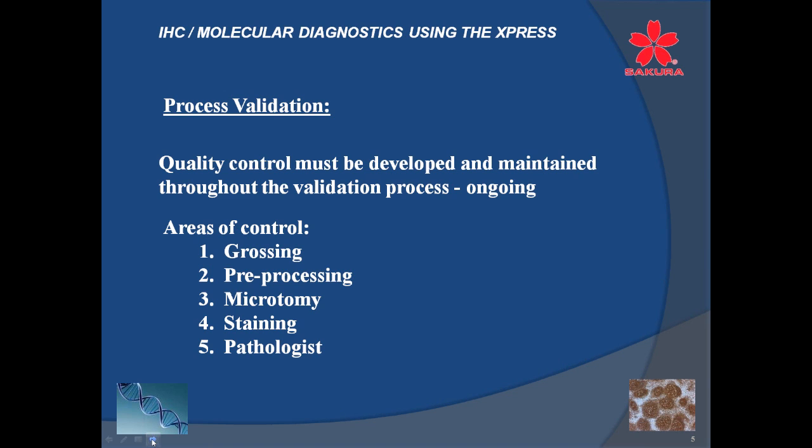And I think that's one thing that as histotechs we're all becoming more familiar with, and more indebted to, and that is this continuous workflow pattern, whether it be in the laboratory, with tissue specimens, with validation, or the list could go on. So the areas of control that I'm talking about are grossing, pre-processing, microtomy, staining, and pathologist.